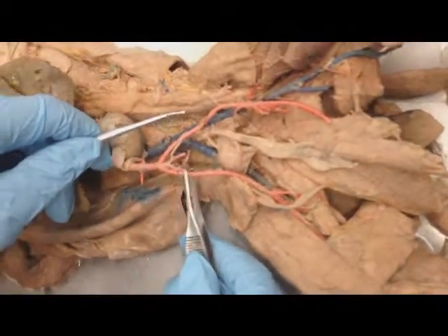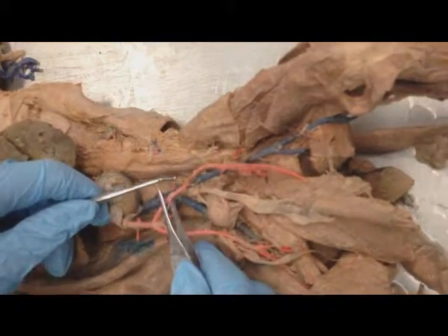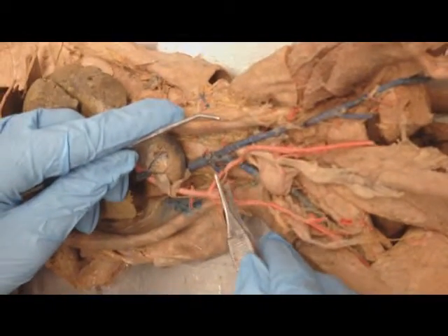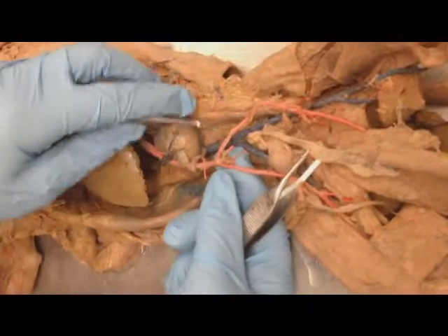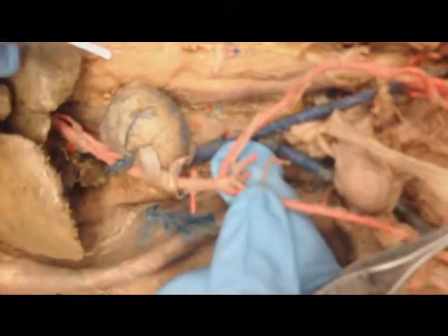Right here are your external iliacs, and on the inside are the internal iliacs. Those two small ones. Not the string. Two there. And a lot of times you will find branching off of this internal iliac, you can see on this cat as well, the caudal artery, that little thing right in the middle.